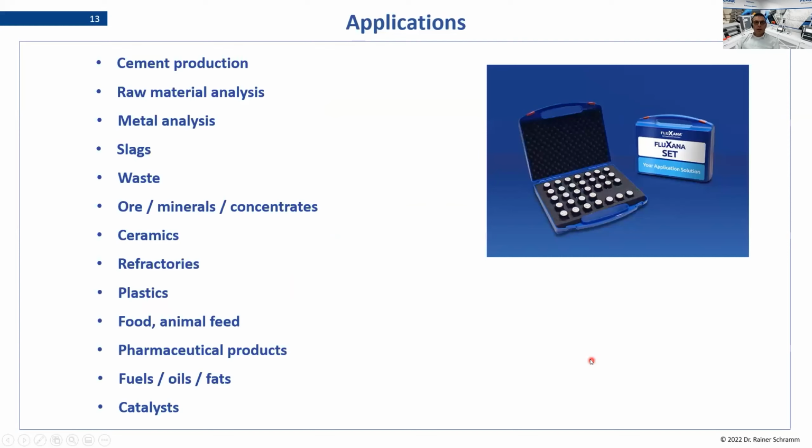If we look on the applications, you will see a long list of industrial applications where XRF can be used. And this is mainly to inorganic analysis. That means, remember, the elements from fluorine down to uranium. When we want to see that into materials, this opens a lot of possibilities, because in the end, X-ray fluorescence is just an atom counter.